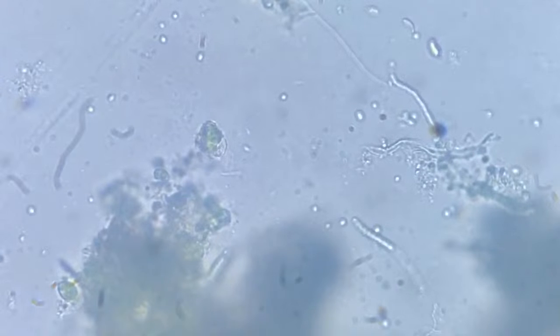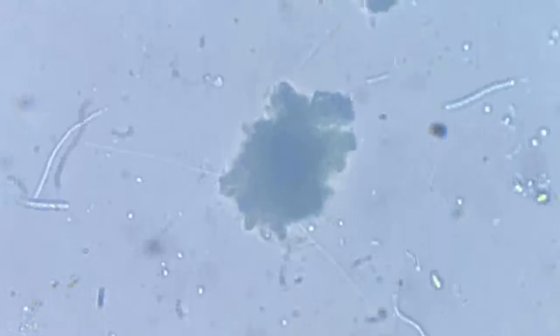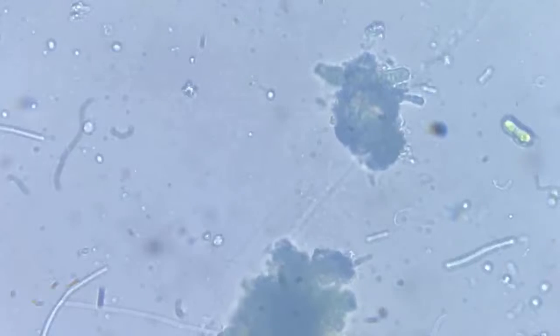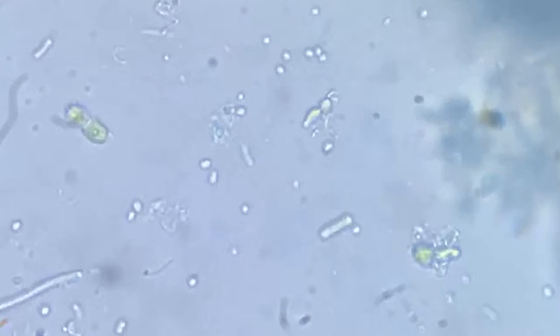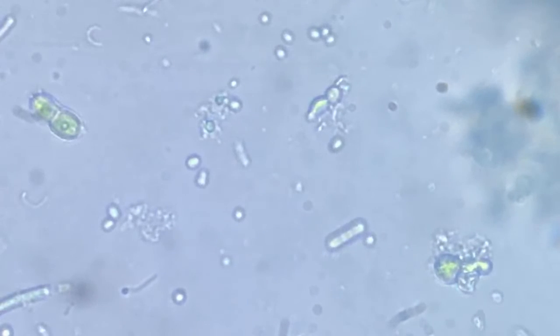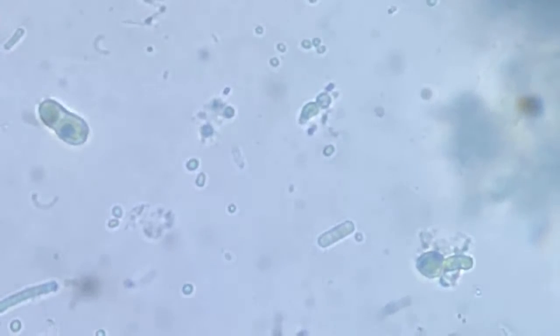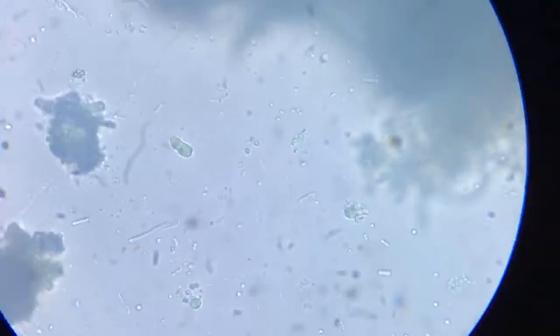Just to give a comparison of its size, I'm trying to find some other organism that we generally know. These are bacteria, so you can see the size that they have, their massiveness. Hope I'll find some.